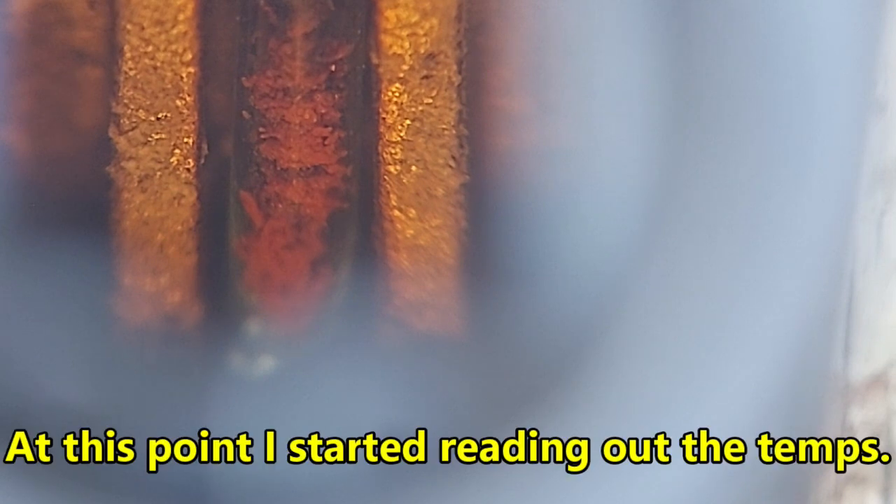After over an hour we're finally starting to get there — we're at 212°C, so we are approaching the melting point. Now at 229°C, then 230°C.